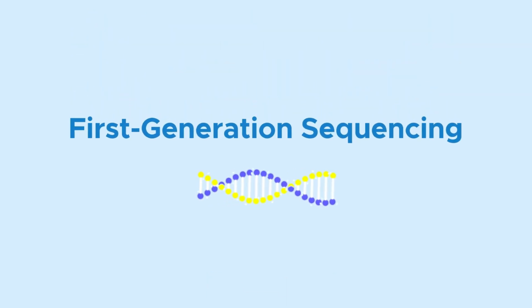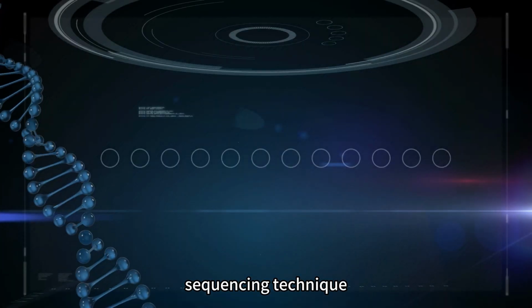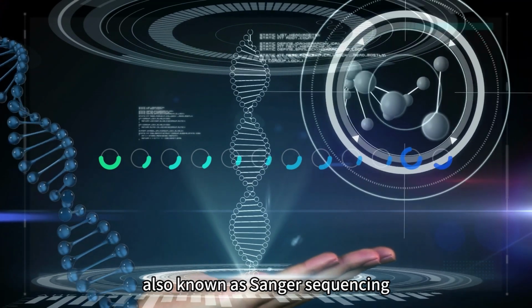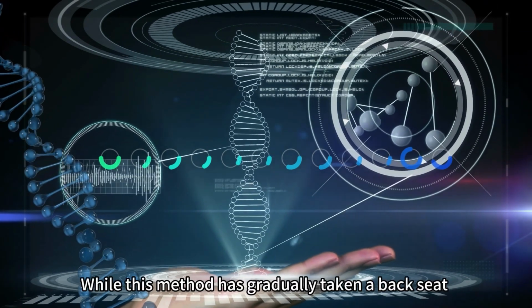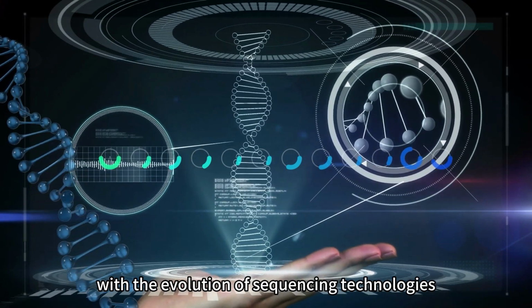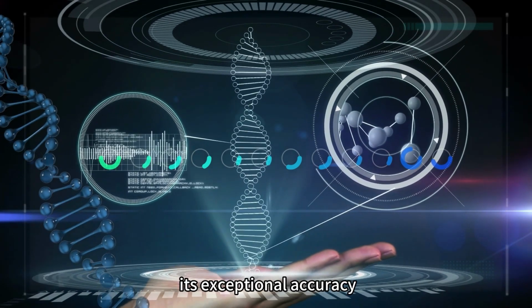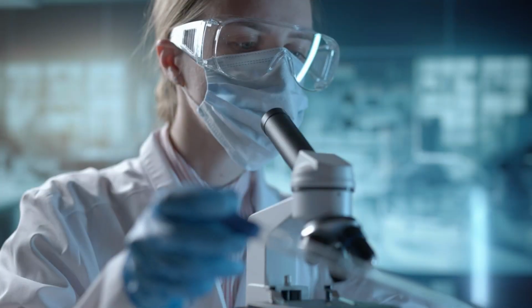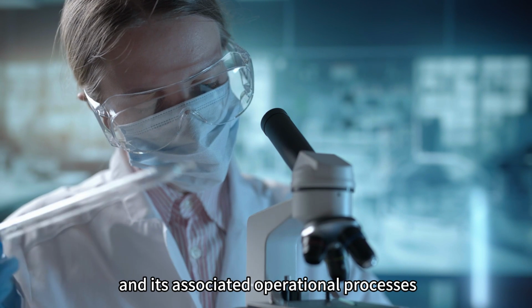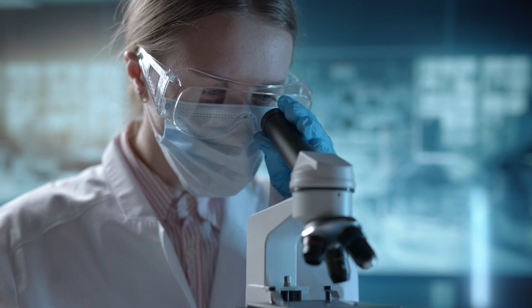Hello everyone! Today our video's theme is to introduce the earliest gene sequencing technique, first-generation sequencing technology, also known as Sanger sequencing. While this method has gradually taken a backseat with the evolution of sequencing technologies, it remains the gold standard due to its exceptional accuracy. In this video, we will delve into the origins of this technology and its associated operational processes. So let's get started with today's video.